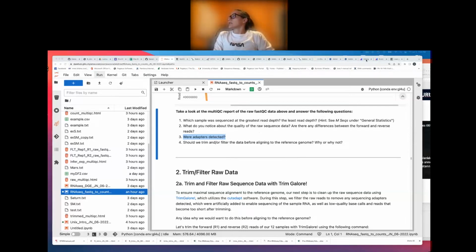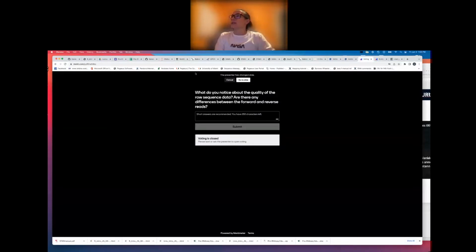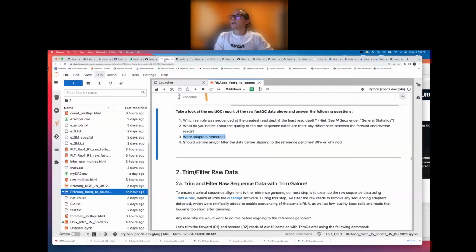If you haven't done so already, make sure you answer the question in the link that Armin sent about whether adapters were detected or not. I'll give another second or two. If you lost the link or accidentally closed out, Armin, maybe you could put the information in the chat one more time, just in case.